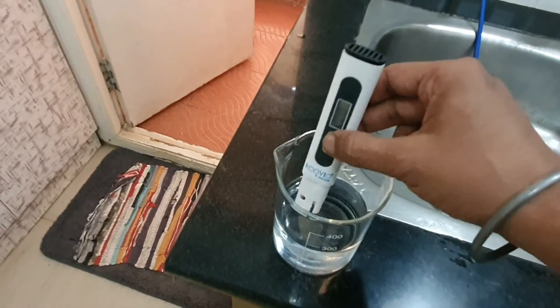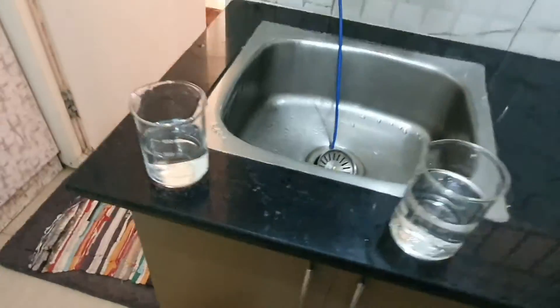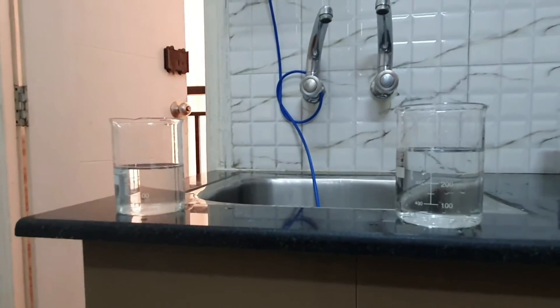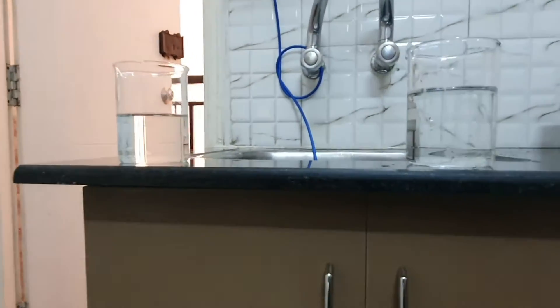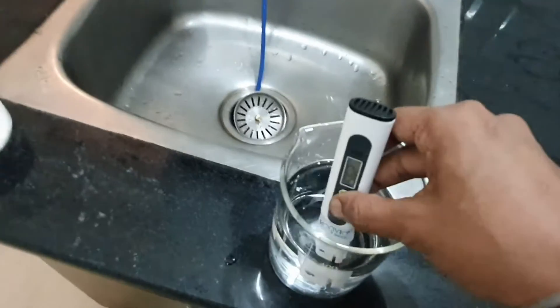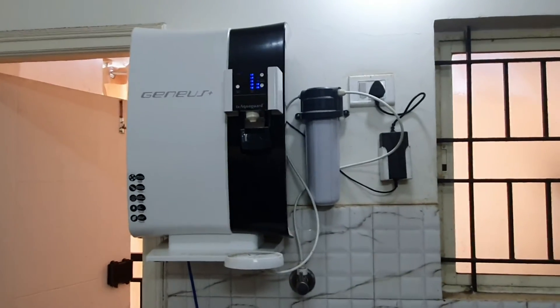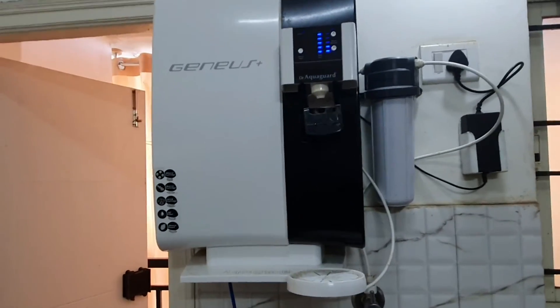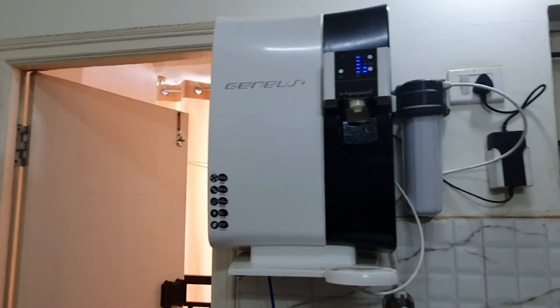The filtered water reads less than 70 — which is amazing. Though they look the same, they are not. The one on the right, the tap water, is not good for you and is not acceptable at all. The one on the left, from the filter, is awesome — less than 100, which is what we intend to drink. You can see 69 here. From 500 down to under 100 is a great improvement, and anything under 100 is absolutely fine for drinking.